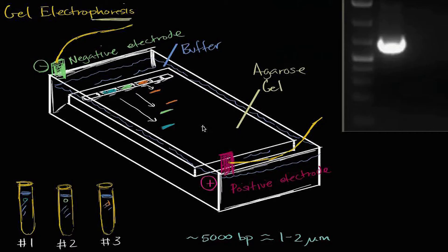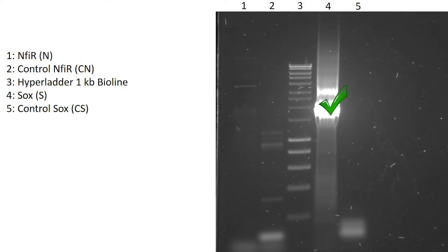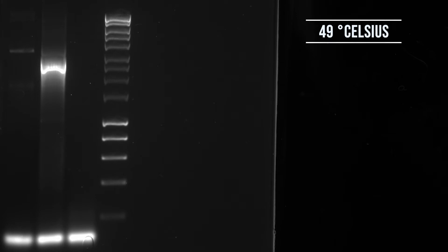Once this was performed, gel electrophoresis was undertaken to confirm or falsify successful PCR cloning. For one of my plasmids, SOX9, I had successfully cloned the primers into the DNA backbone. However, for NFIB, no band was seen, meaning that PCR cloning had not been successful. After modifying the annealing temperatures for PCR, we as a team managed to successfully insert the primers necessary for NFIB cloning.